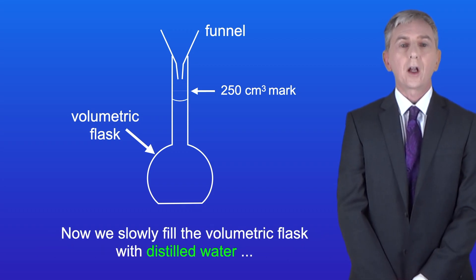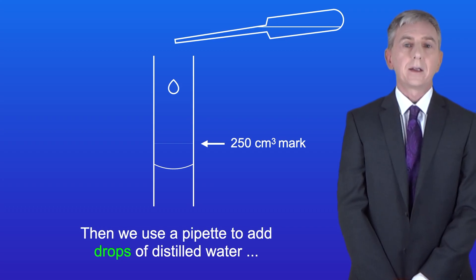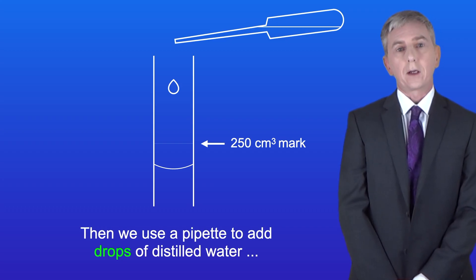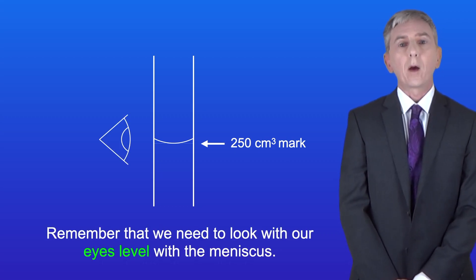Now we slowly fill the volumetric flask with distilled water so that the level is just below the 250 centimeters cubed mark. Then we use a pipette to add drops of distilled water until the bottom of the meniscus is on the 250 centimeters cubed mark. And remember that we need to look with our eyes level with the meniscus.